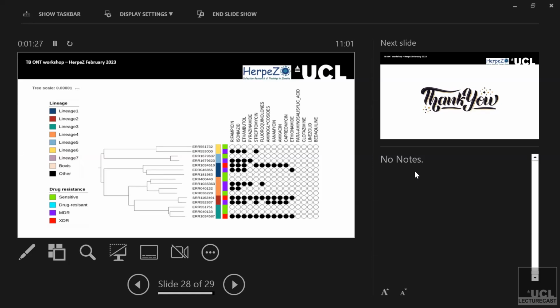Yeah. Just wanted to add that because sometimes we talk about how drug resistance is spreading and how to treat it and the drug resistances. You can actually see if you are having transmission of drug resistance, because you'll see that they will cluster together, and then they'll also have a similar drug resistance profile. So it's a very good tool. It's a snapshot of what might be happening in your area.